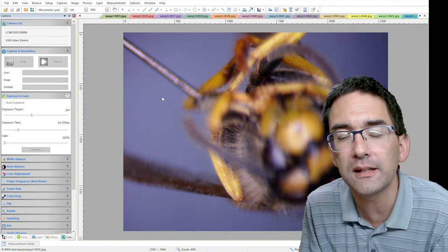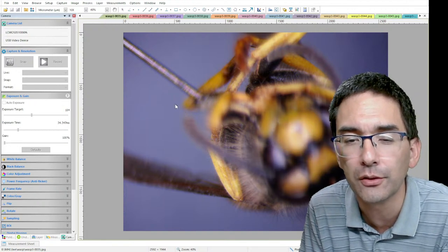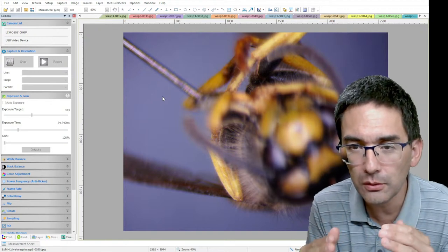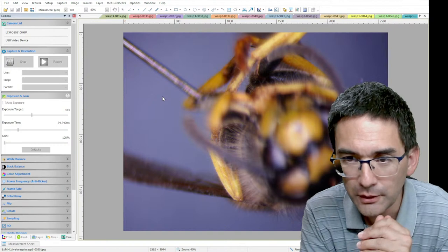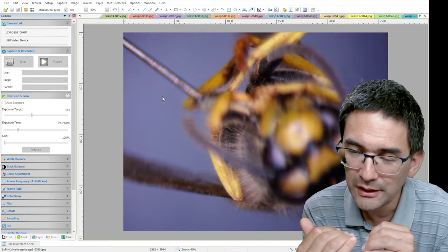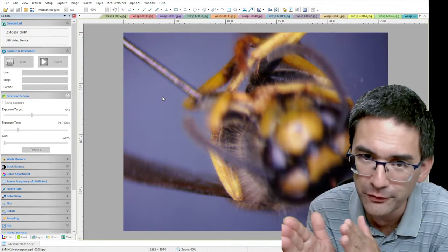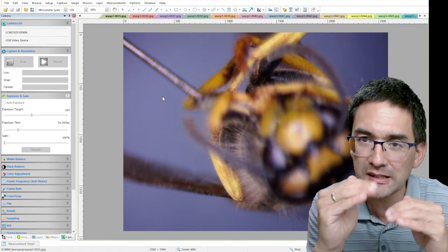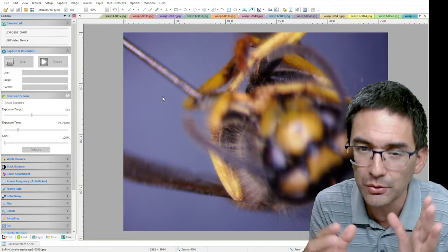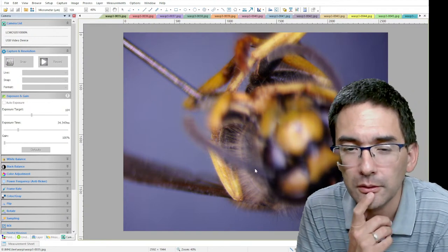I have to click shift and scale. You see, there was a question about rotate. That would be the third one here. But I didn't have any rotation here. Why scale? The thing is the following. When you focus with a stereo microscope and you focus down, because the specimen is closer, some parts will also become larger. So you see there is this horizontal shift because of the off axis, and then there's also a slight change in size as you focus, because the further down you go, the larger it becomes. And that's why there's this shift in scale. And I click finish and I let the program run.